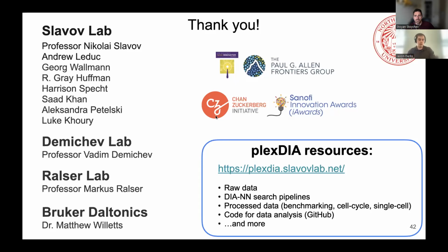So TMT Pro and mTRAQ have different chemistries. And even if you combine them to, say, form a 6-plex, they're not going to elute at the same time because of these different chemical labels. Okay. Hopefully that answers the question.